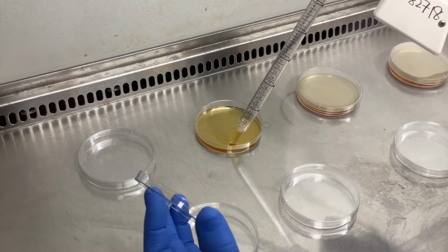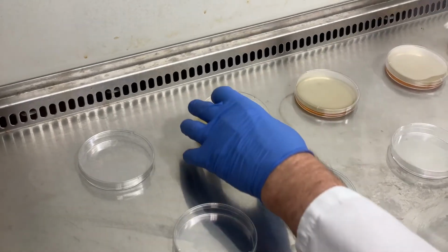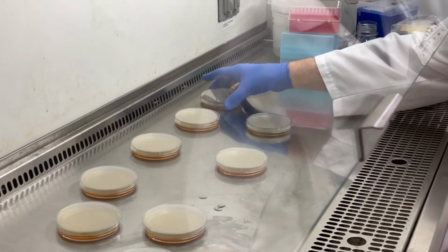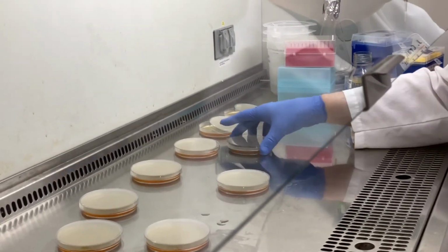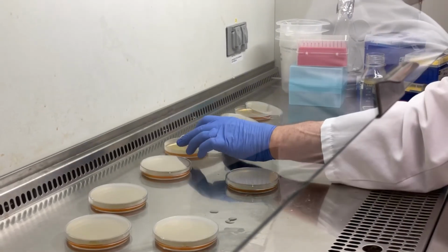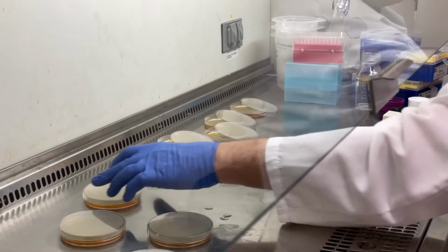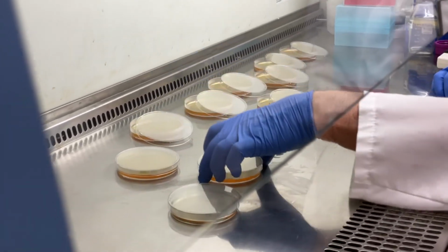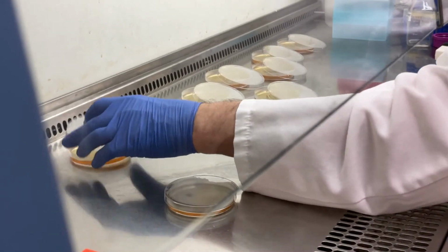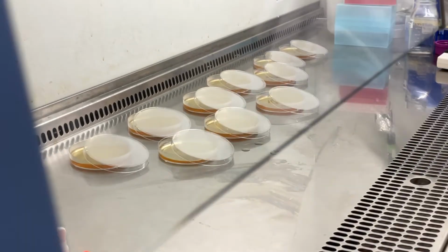Getting rid of that fluid is important and can be done by a number of methods. It's important to dry these plates by airing them out under the laminar flow or leaving them open for probably 10 to 15 minutes to reduce the amount of moisture in the plate. These will be stored inverted, and they will condense further during storage.